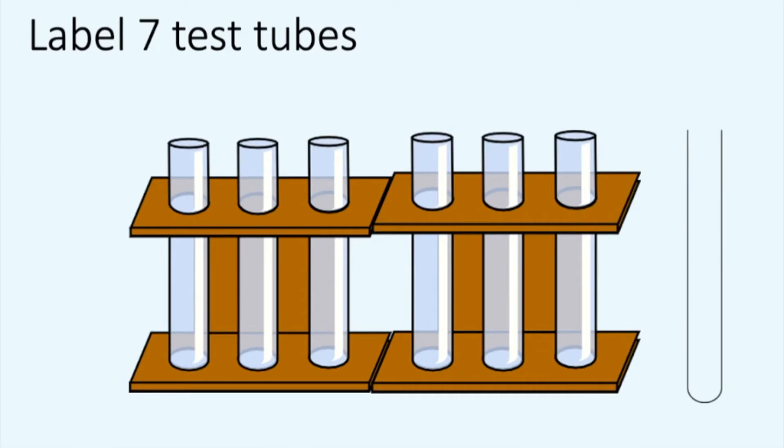Label the seven test tubes 1.0, 0.8, 0.4, 0.2, 0.1, 0.0, and then another test tube X for your unknown concentration.